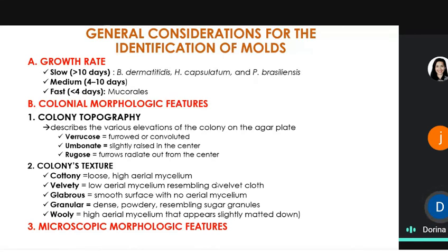Okay? Now, for the colonial morphology, pareho lang naman din. Mas madali nga silang i-identify. Kaya lang, I understand dun sa colony texture kagabi, sabi ko, makita kaya na powdery ito? Makita kaya na velvety ito? O ito ba ay, ano pa ba yung mga ano nyo? Mucoid is hindi kayo magkakamali doon. So, ang nagkamali sa mucoid, -5. Kasi alam nyo na kung anong itsura ng mucoid. Pag ni-review ko mamaya yung inyong pre-test. Okay? I can understand kung di mo ma-distinguish si granular ke velvety. Pero si granular kasi, pag talagang nasa lab kayo, makita mo talaga yung kanyang colony texture. Okay?